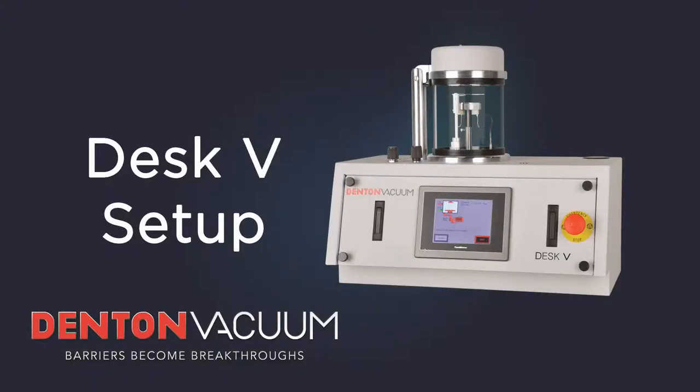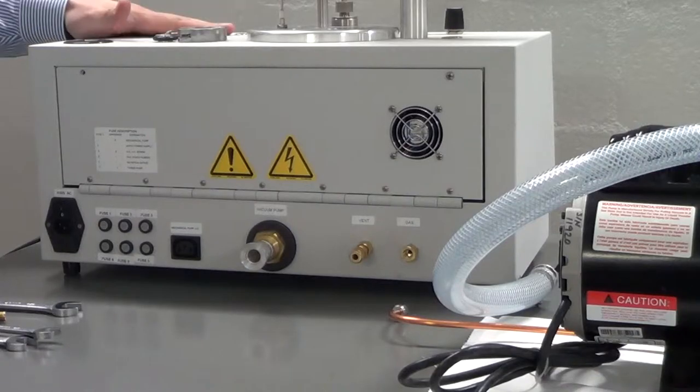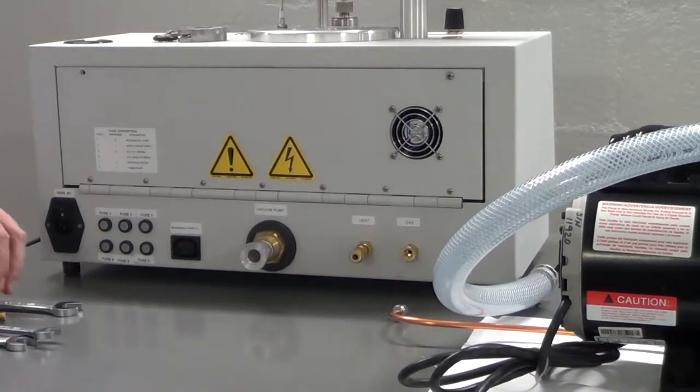Thank you for purchasing the Desk 5. After you have unpacked the Desk 5 and placed it in your work area, you'll want to start in the back of the unit.